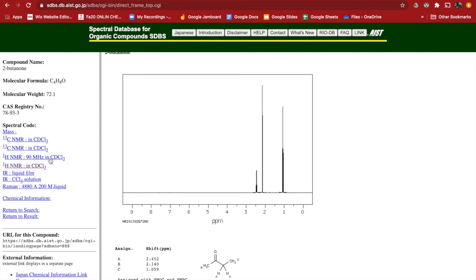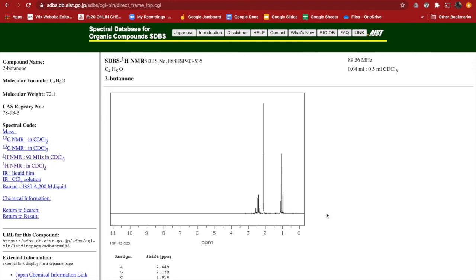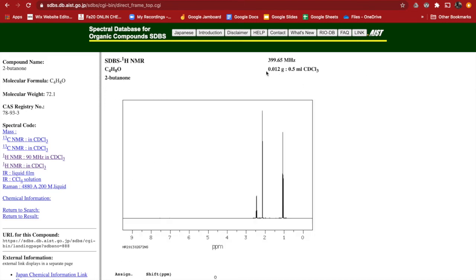But the older, cheaper NMR spectrum is not as tight, all the signals. In this view, it's nicer. But yeah, believe it or not, the 400 megahertz sample NMR is way better if you own the instrument, because you zoom in on this and you can see exactly what's going on.